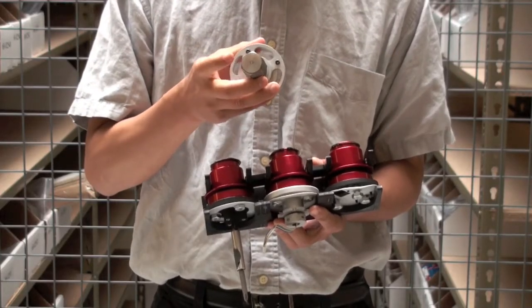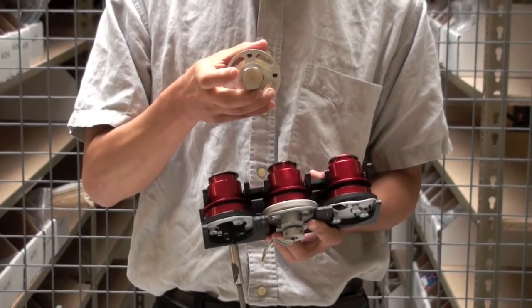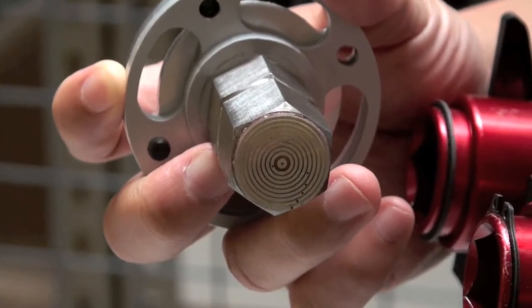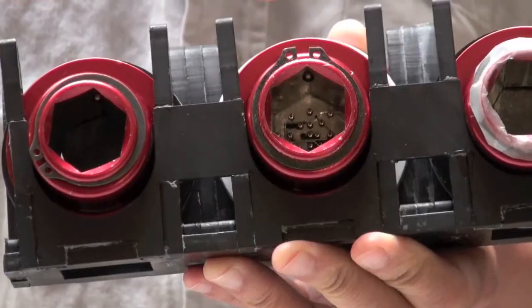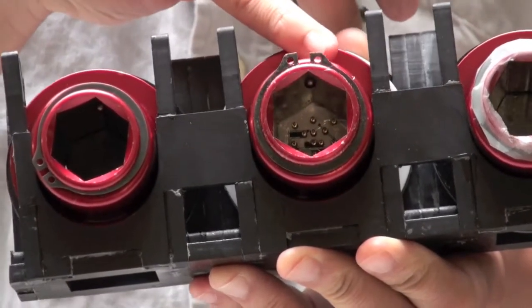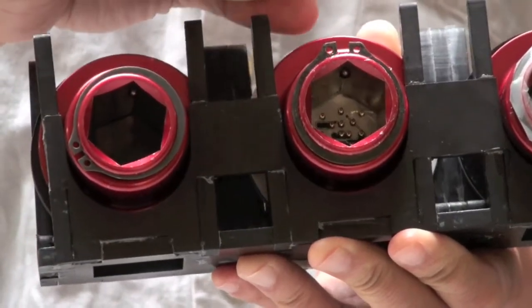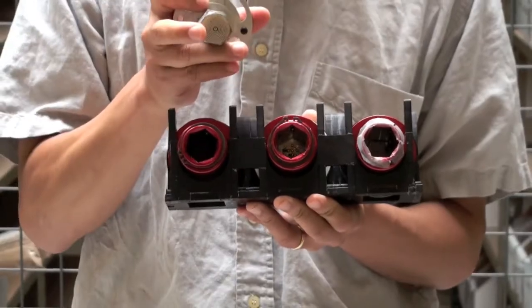That's what we have on the end of this part. There are these concentric rings, which are the connectors that form the electrical connection between the robot arm and the gripper. Inside the gripper housing, there are what are called pogo pin connectors, so when this part goes into it, those pogo pin connectors make contact with these concentric rings.